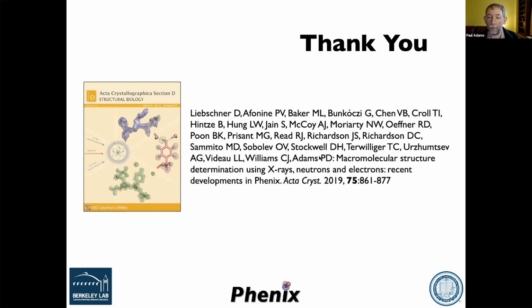Currently, in single particle Cryo-EM, the typical resolution is more around between 3 and 4. Now, that's not an intrinsic limit of the experiment. As people have shown, you can get to close to 1 angstrom resolution with electron microscopy. So it's not an intrinsic limit.